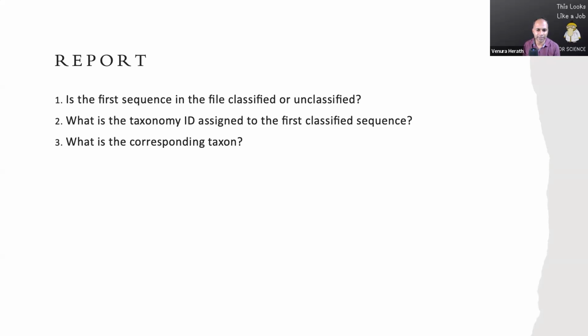Regarding the second column, it may vary. If it deviates from whatever your result, you can use the chat box and type the taxonomic ID you got. One and three, definitely you can answer. Second one, most probably 99%, I guess. I'm not doing any mean separation like Hasnan mentioned to us earlier.